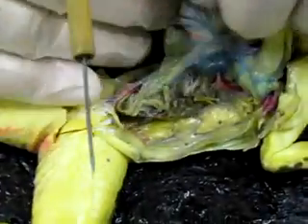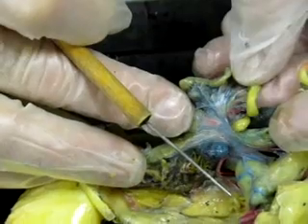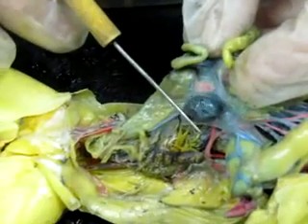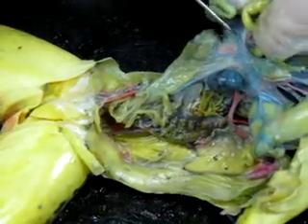And it's held in place by this saran wrap material we called mesentery. All of this is my mesentery with all the arteries and veins coming into it. All this is mesentery. Located amongst that will be the spleen here. Okay? Now this material is mesentery.